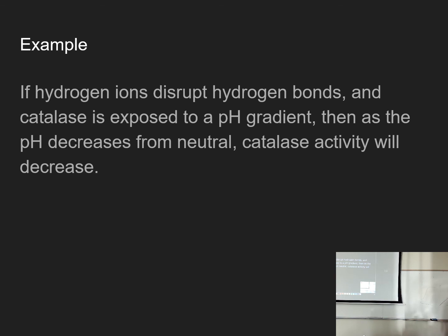sometimes you'll have data points here with a little error bar, but this error bar up here is huge, let's say. This is what I would call a statistical plateau, meaning the averages did go up, but the variability is huge here and it overlaps with this one. So if you see that, you might have to explain why that happened based on how enzymes operate.